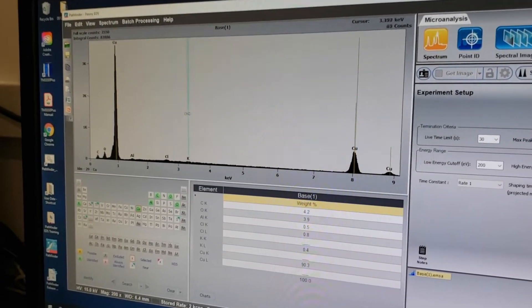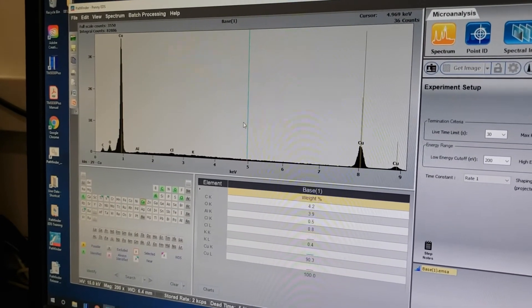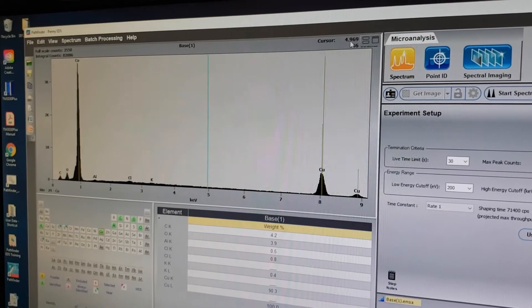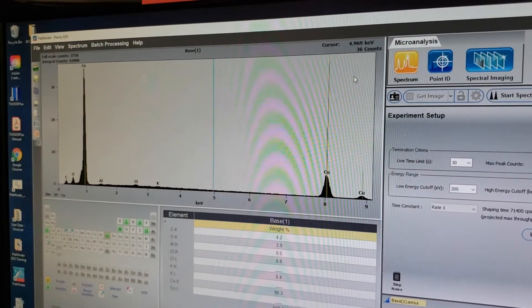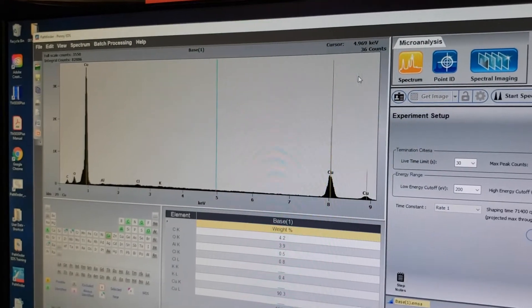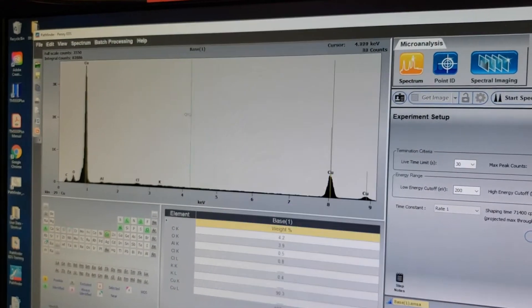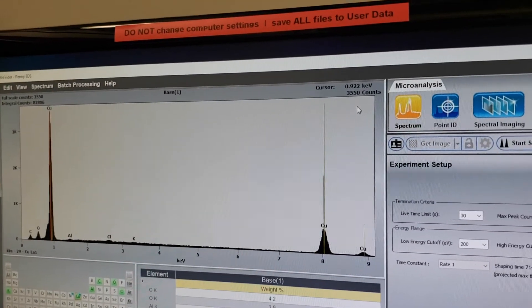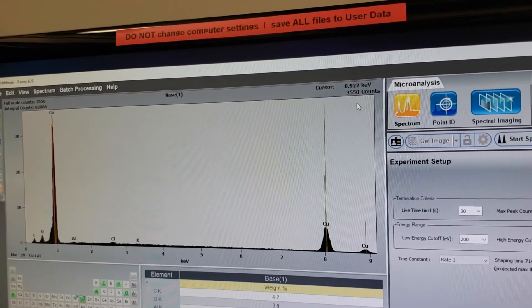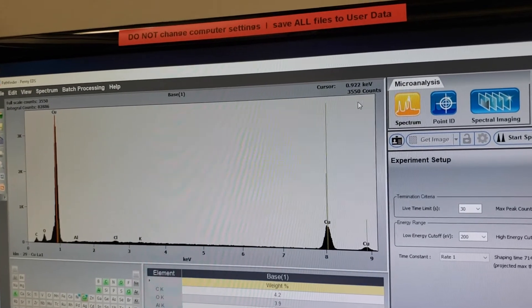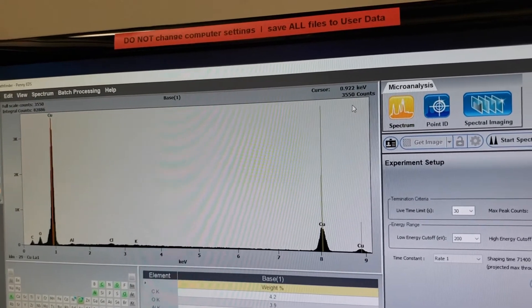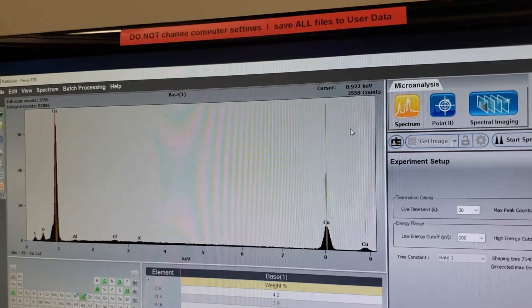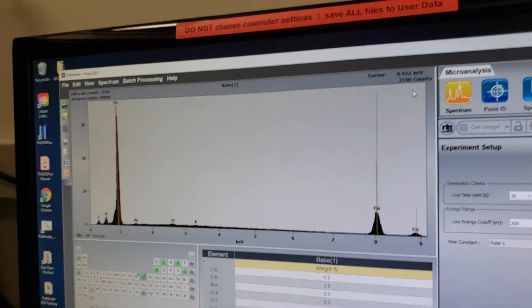This blue line is called our cursor. Up in the top corner you can see the cursor is at about 5 keV with 36 counts at that location. If I move the cursor over to my copper peak, there are actually 3,550 counts on top of my copper peak. So you can see how many counts are in a particular location and what x-axis position you are on — basically your x and y.